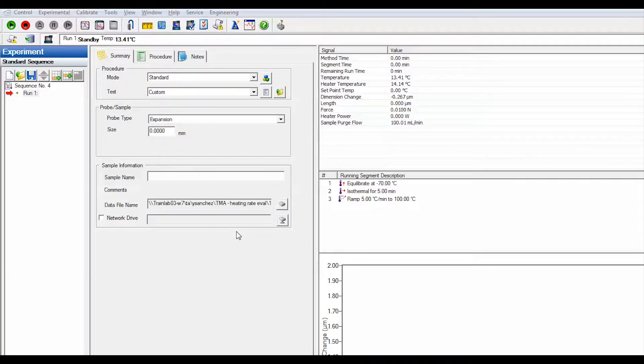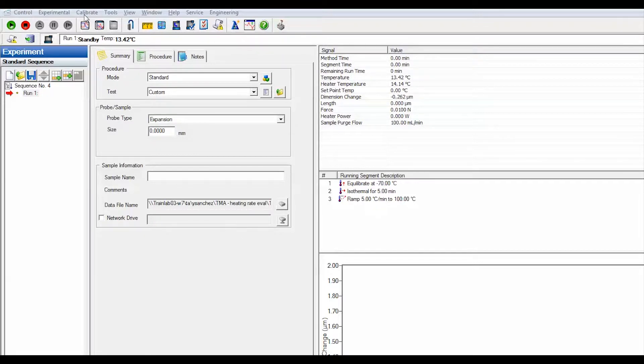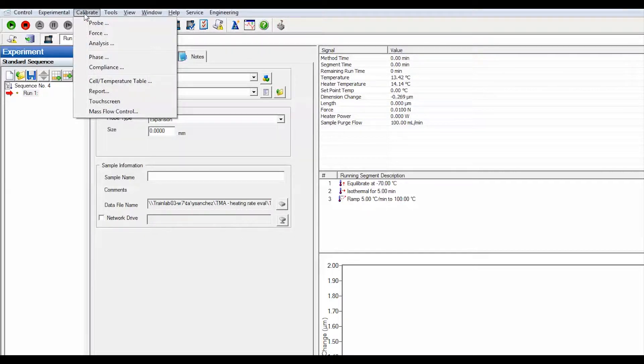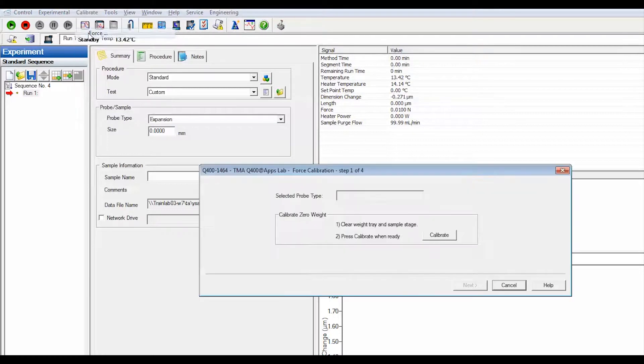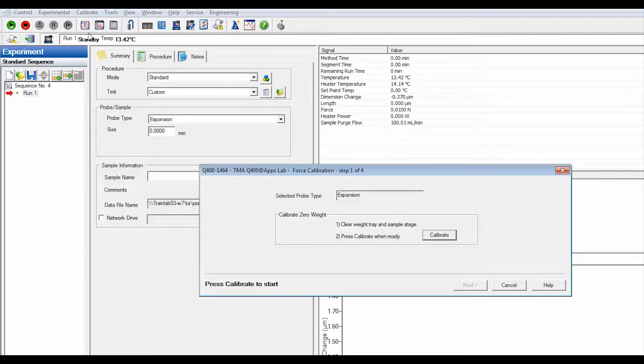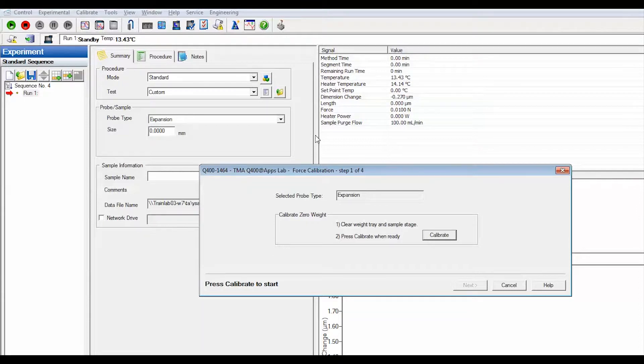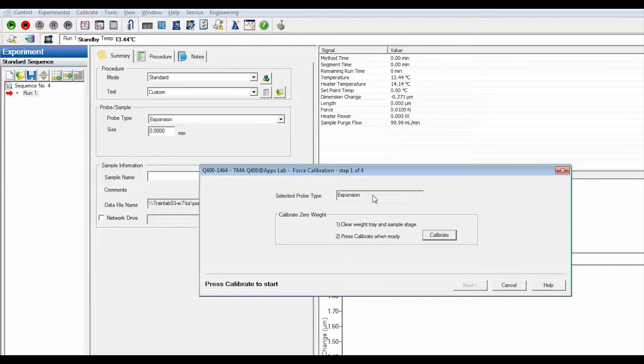To calibrate force using the instrument control software, select calibrate force and follow the directions that appear on the screen. This window will indicate the type of probe installed and the first step is a zero weight as reference point for calibration.